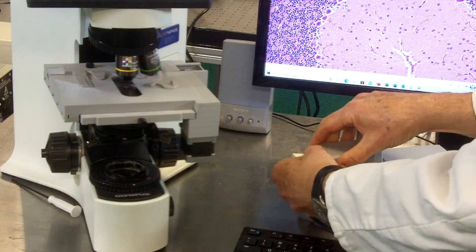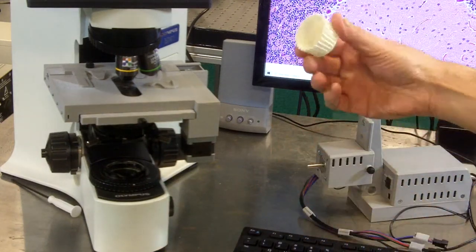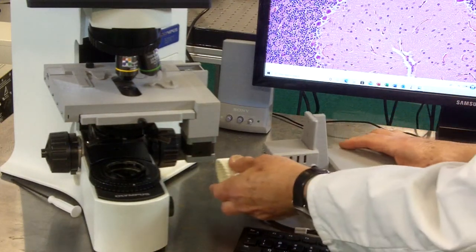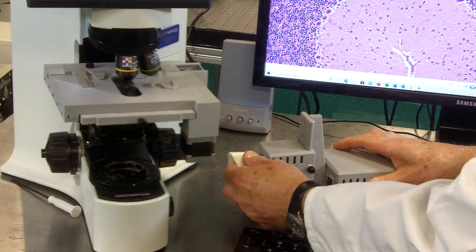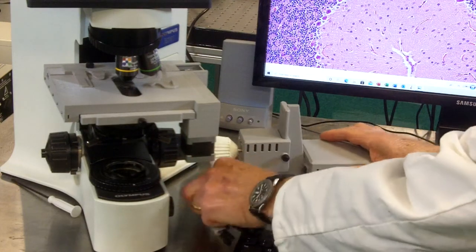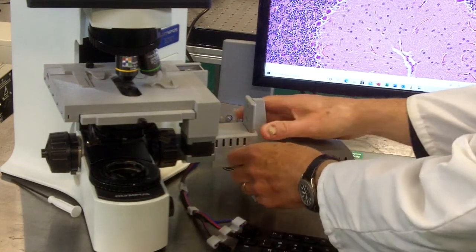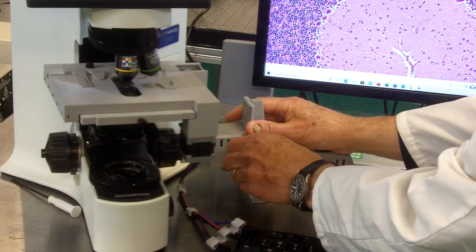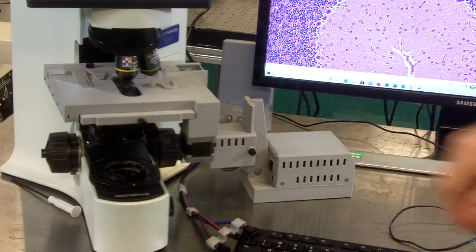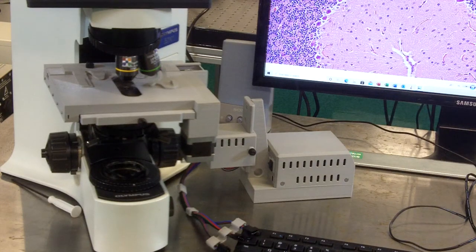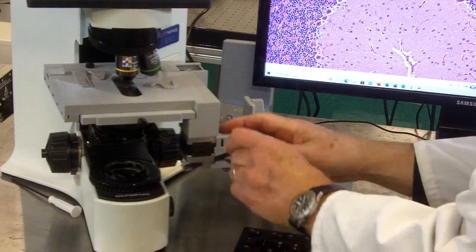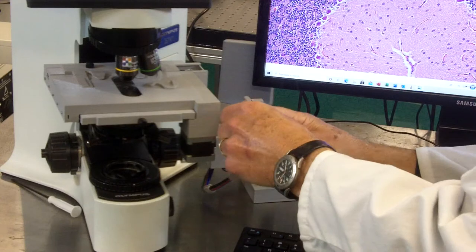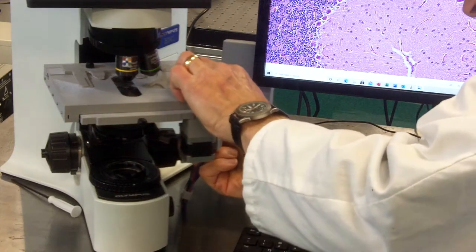Here are our interchangeable gripper cups that fit onto the stepper motor drive shaft. We then set that to a good position so that it grabs onto the fine focus knob of the microscope, and we simply connect the three connectors.